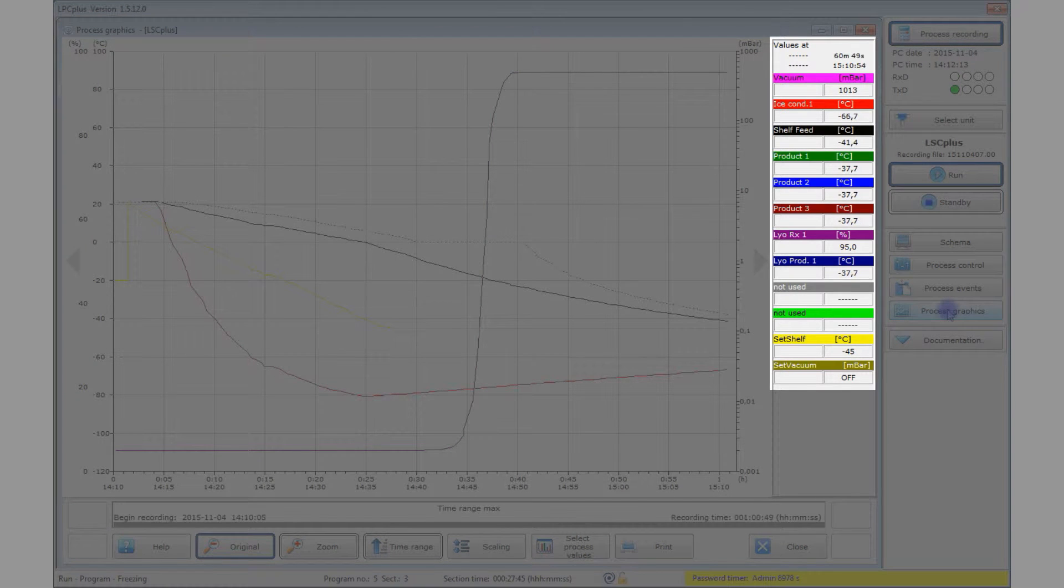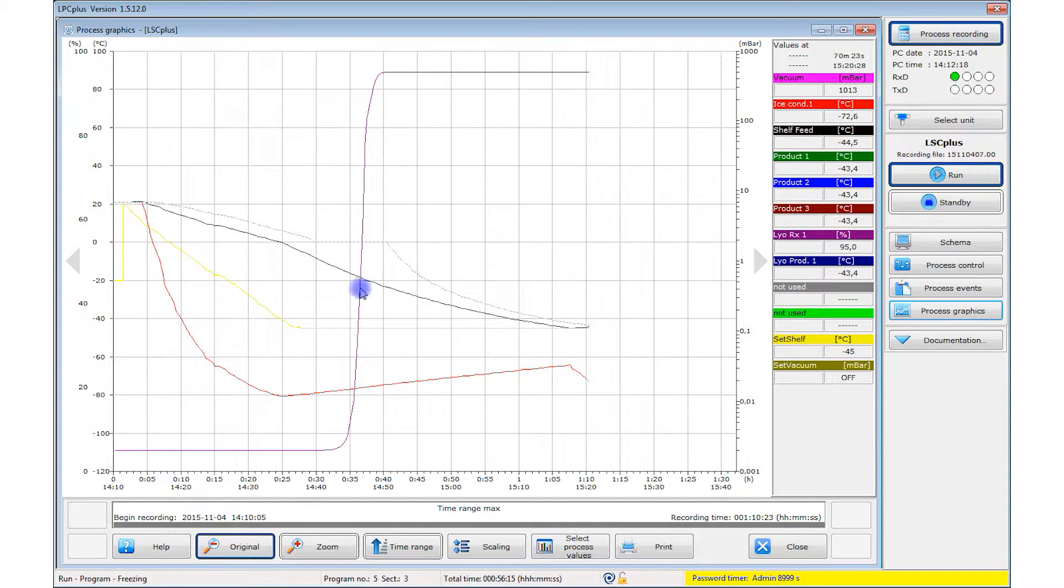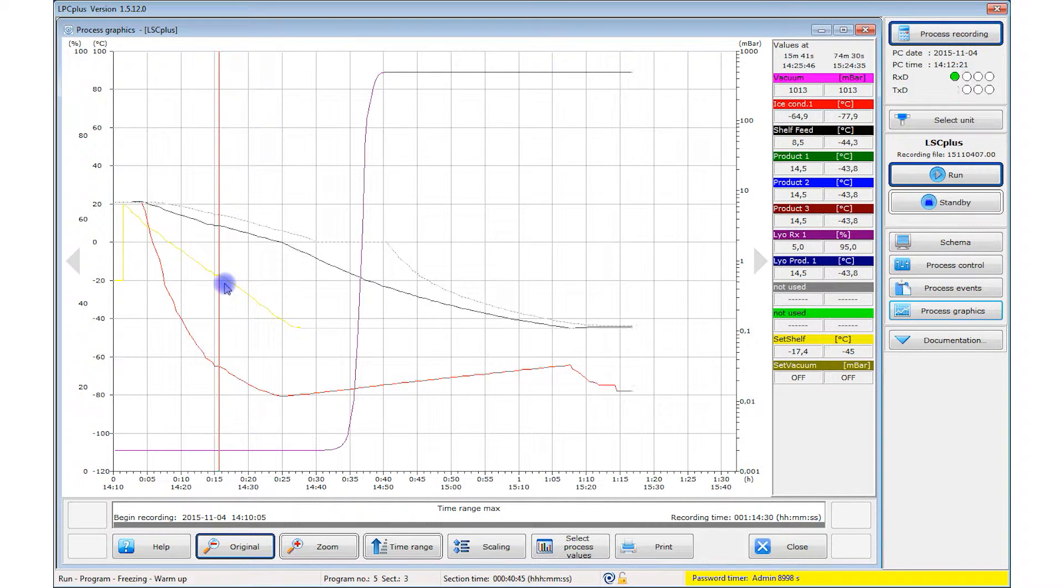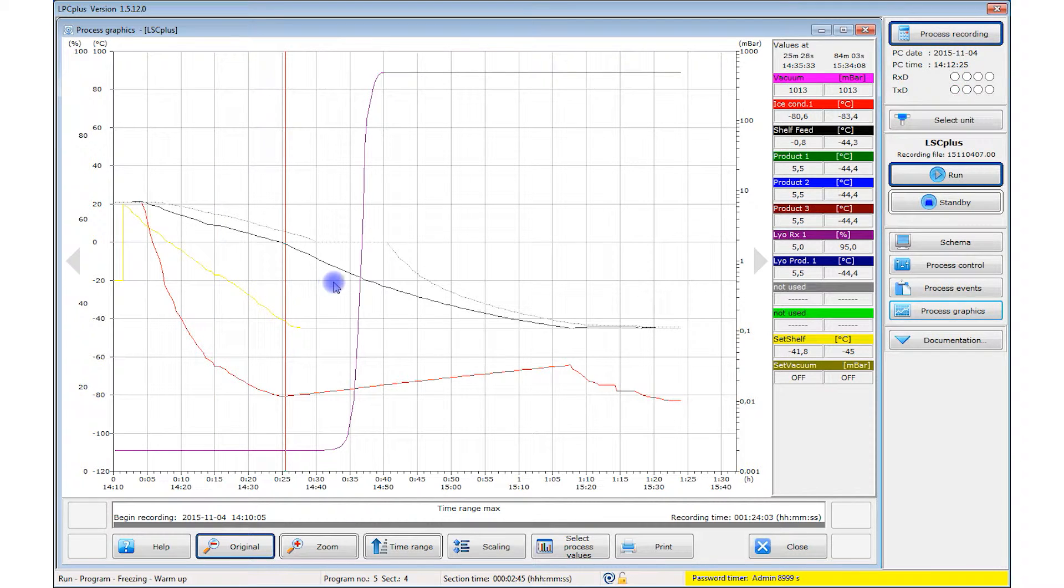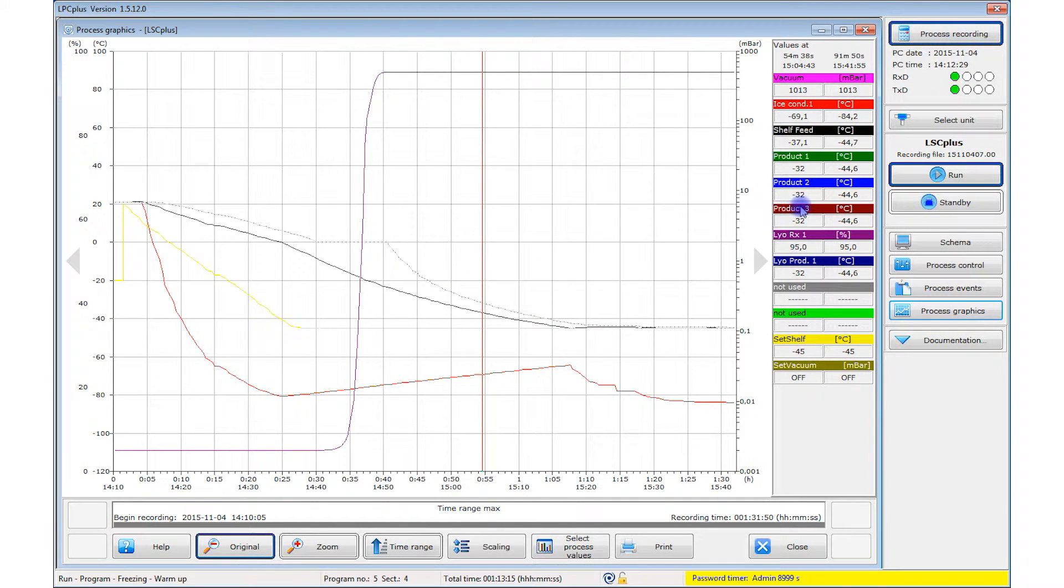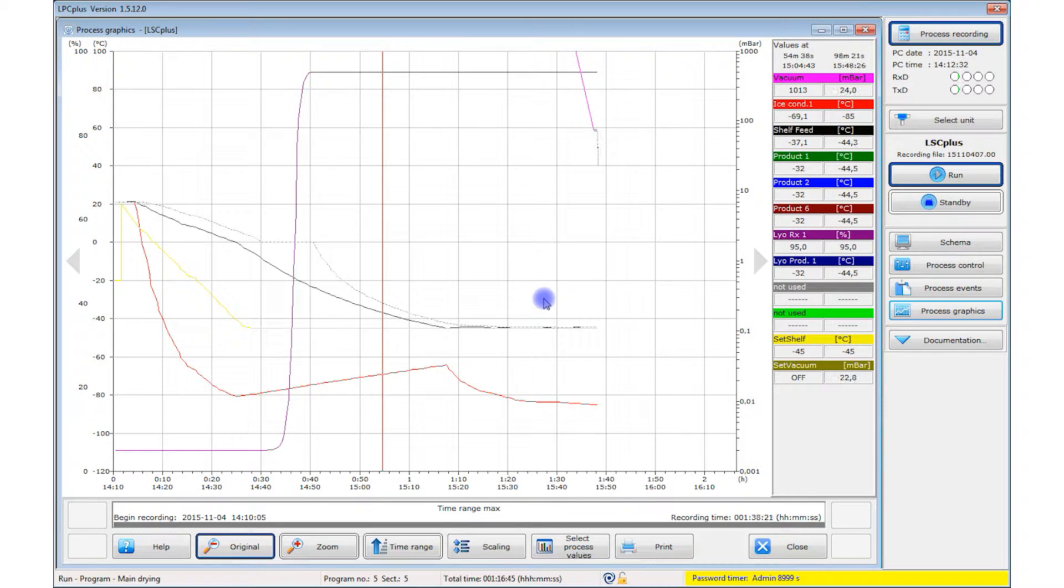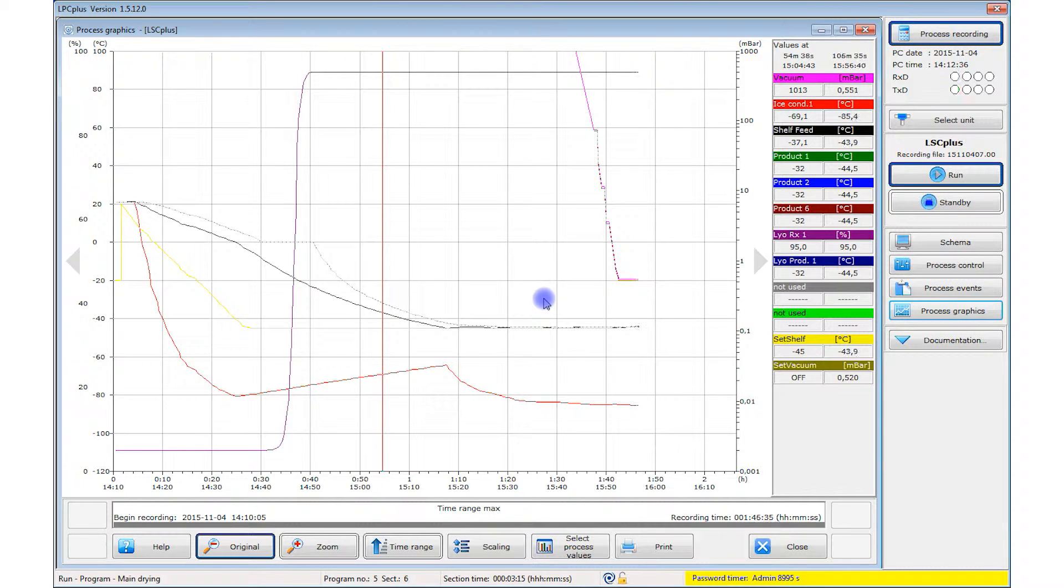The current numerical values are also shown in a table next to the graphic. To view the numerical values at a particular time point, click on the process graphic. A red cursor line appears and the table shows the process data at the selected time. You can move the cursor line anywhere in the process graphic. You can configure the parameters to be displayed in the process graphic and the table. This allows you to view and monitor significant process data during the process time.